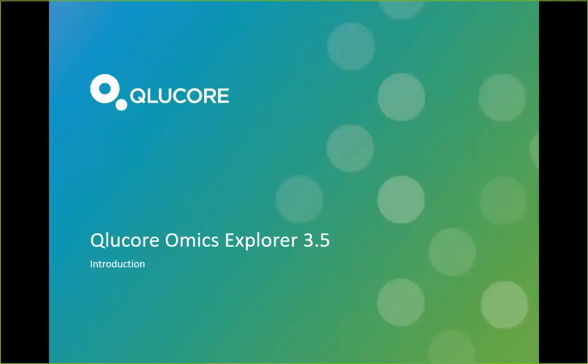I'm here today to present to you our new and exciting version 3.5, which contains quite a few new items for you to use in the software. So this webinar is a general webinar about 3.5. We will have continuing webinars in the future with in-depth focus, and a little bit longer than this one, on the various aspects of 3.5. So today I'm just going to give a brief overview of what's available, what kind of new features are available in the software today. So that's what I'm going to do today.